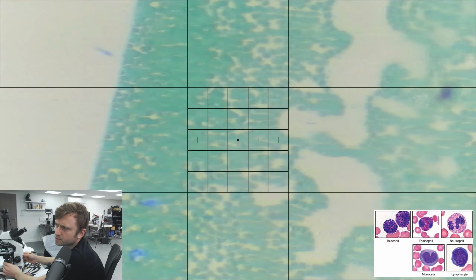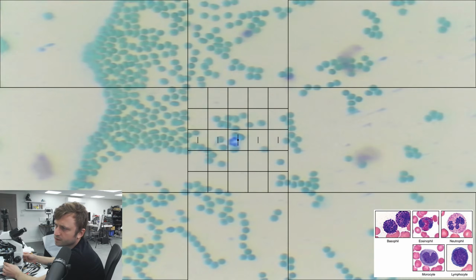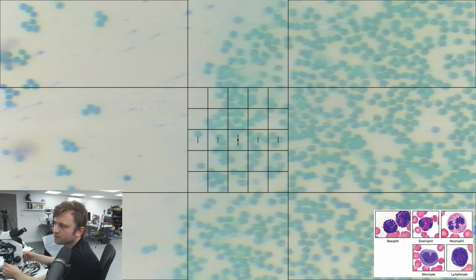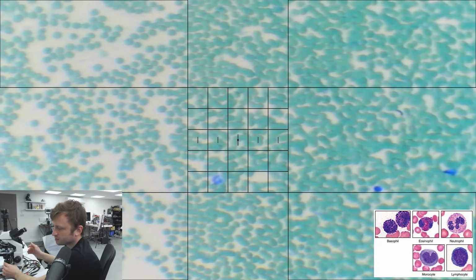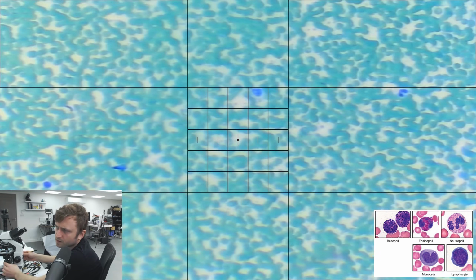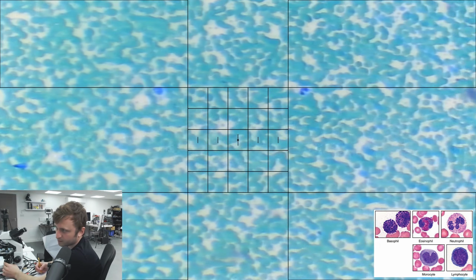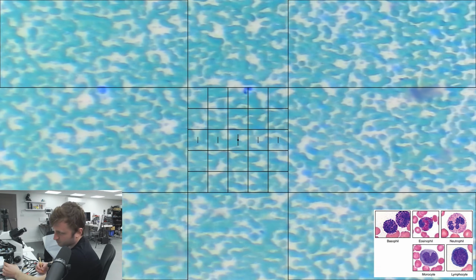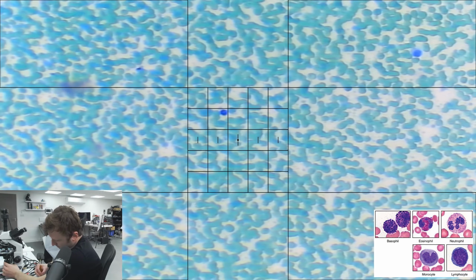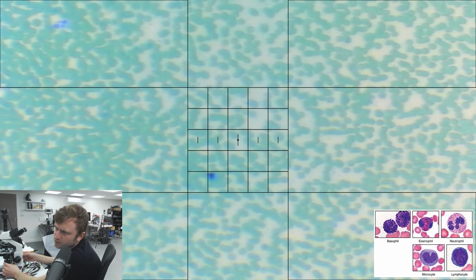There we go. Let's continue along. A clear neutrophil, quite a pretty one. I've done about 20 so far, I think. Neutrophil again, bottom. Lymphocyte, unknown or debris, yeah. Lymphocyte, assuming I hadn't already counted that one, which I might have done. Neutrophil, but even if I have already, like I said, it's not an accurate one. Lymphocyte, neutrophil, I don't know whether to consider that one.